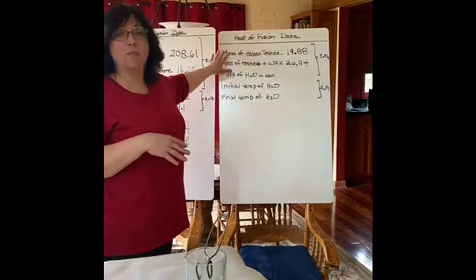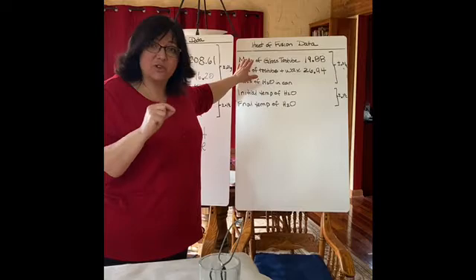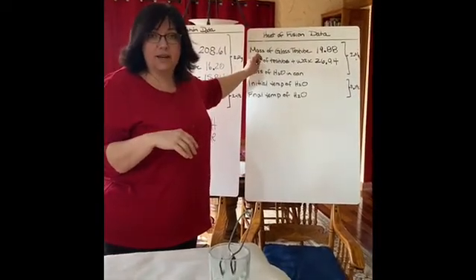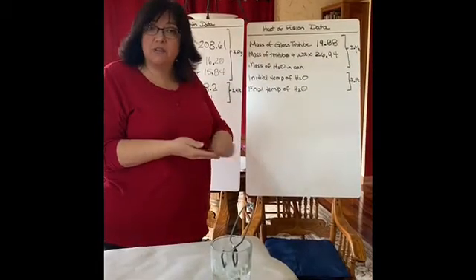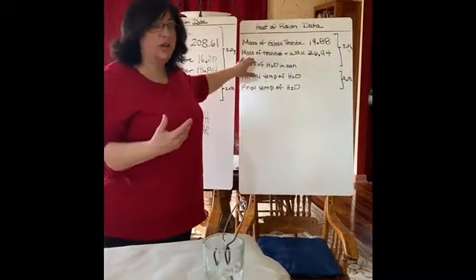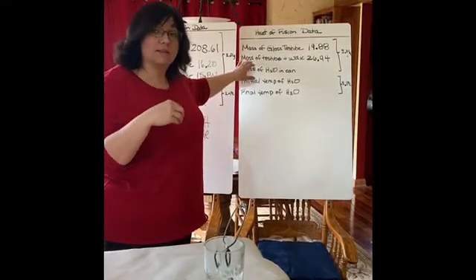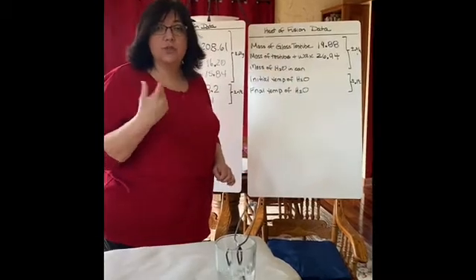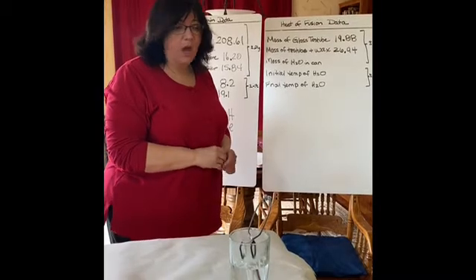So I did this many years ago, weighed an empty test tube, and I etched the mass onto the outside of the test tube. So I know that the mass of the test tube was 19.88 grams before I put the candle wax in. Then I put a bunch of candle shavings in there, melted it, and today we weighed those shavings when they were obviously solid, not liquid, and we found that the wax plus the test tube weighed 26.94 grams. So take the difference, figure out how much candle wax is actually in the test tube.